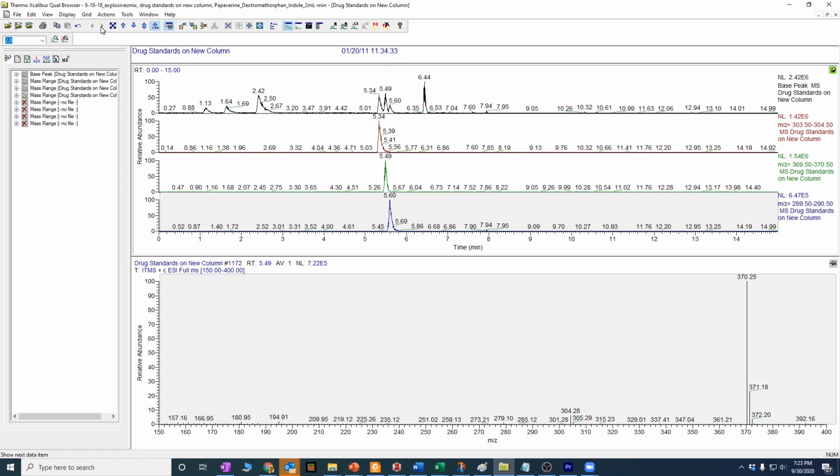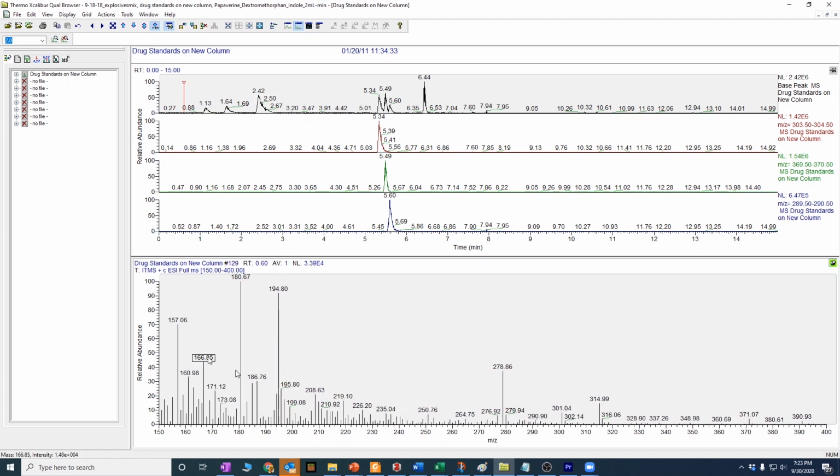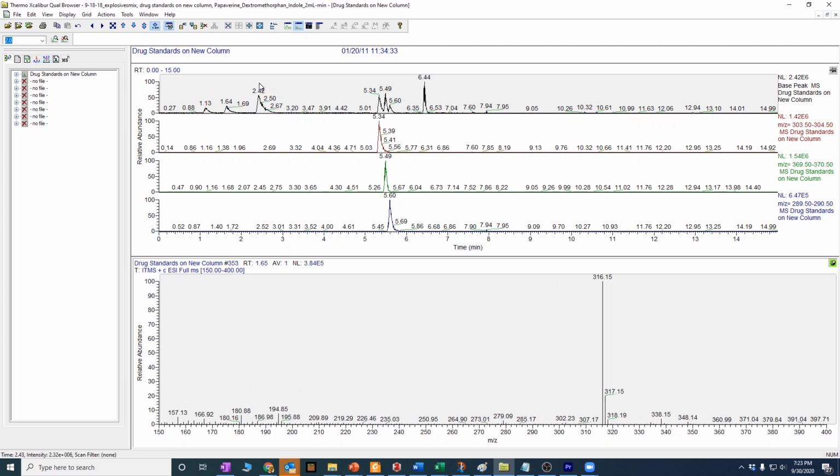That's not just because of what you can do here. It's related to that. There's a trick called MSMS you can do that dramatically improves the sensitivity. But the UV and the MS detectors are both powerful because those are going to be by far the most common detectors for LC. But as you click through your chromatography, you also get spectra at each point that give you some idea of what you're looking at.